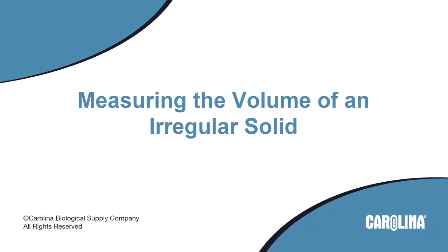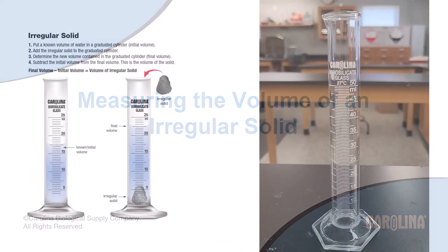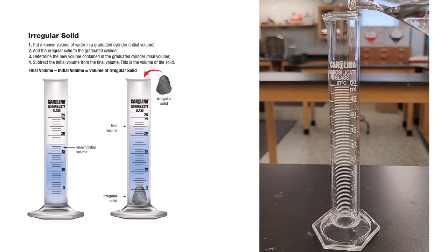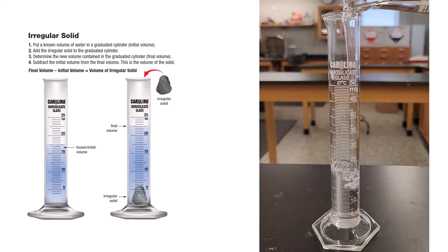Measuring the Volume of an Irregular Solid. To measure the volume of an irregular object, you will need a graduated cylinder. The graduated cylinder will need to be able to contain your object and enough water to cover the object, and still be within the markings on the graduated cylinder. Select a graduated cylinder of appropriate size. Place the graduated cylinder on a flat, level surface. Pour water into the graduated cylinder. Make sure there will be enough water to cover your object, but not to overfill the graduated cylinder when the object is added.